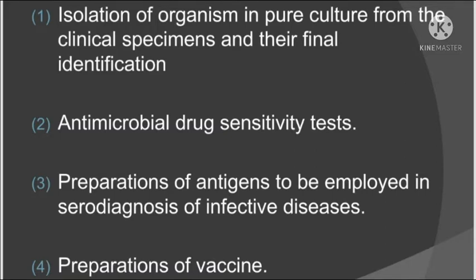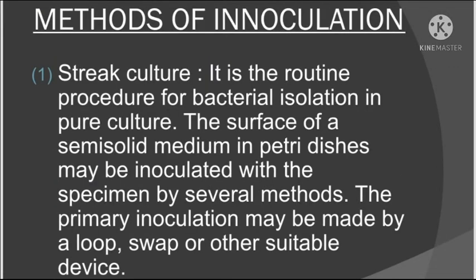Cultivation is required for the isolation of organisms in pure culture from clinical specimens and their final identification, for antimicrobial drug sensitivity tests, for preparation of the antigens to be employed in serodiagnosis of infective disease, and for the preparation of vaccines.